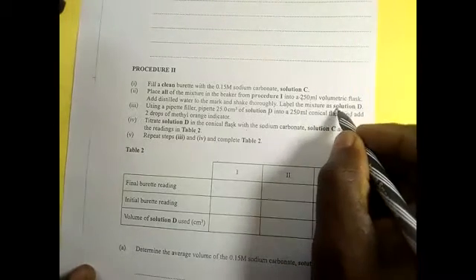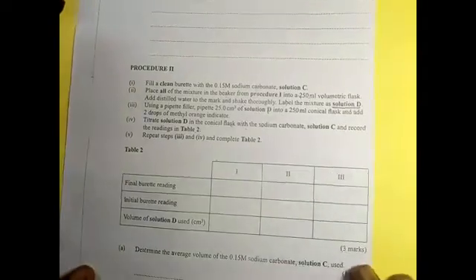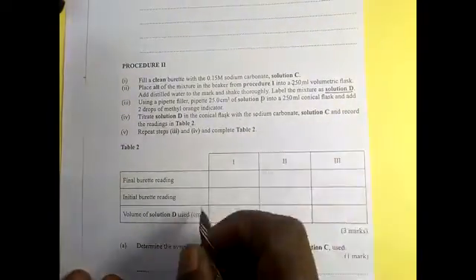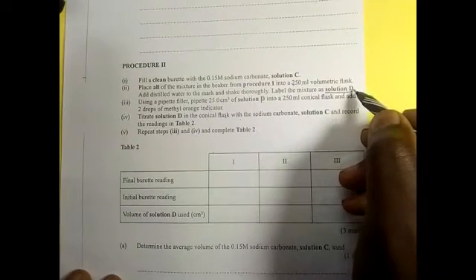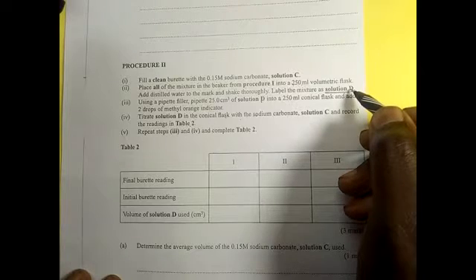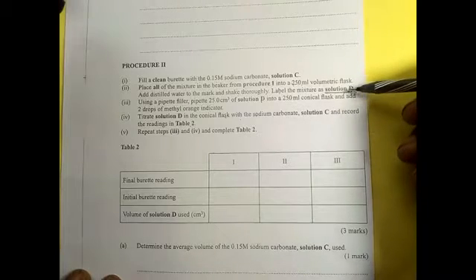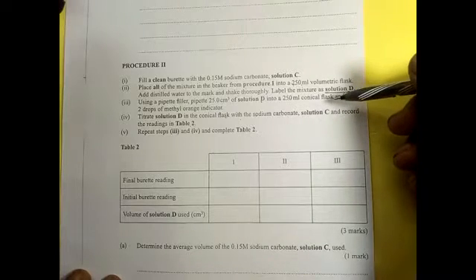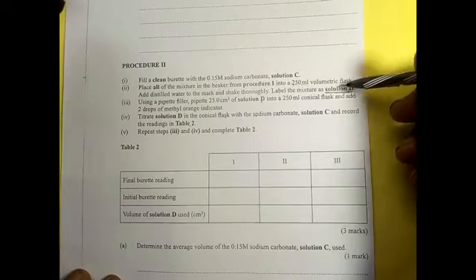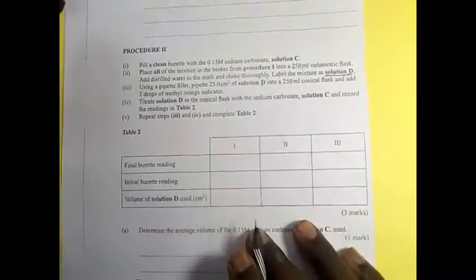We have prepared a solution we call solution D. Now we are titrating solution D, but remember solution D is hydrochloric acid, HCl. The difference between B and D is the concentration and the number of moles, because this one has been diluted. So let us use this in our table.